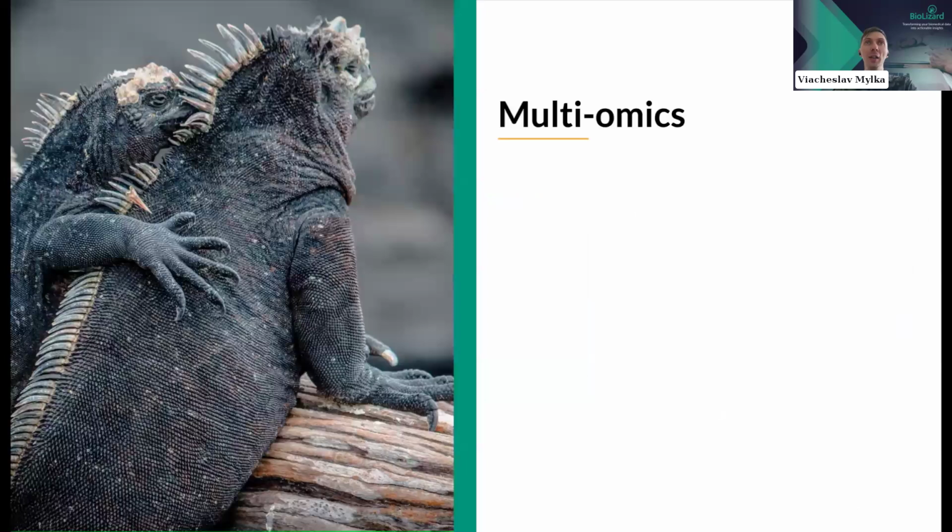and to give the word to a colleague of mine, Volodymyr, who will be talking briefly about another extremely important and also challenging part in data analysis, which is integration of different omics, so multi-omics analysis.